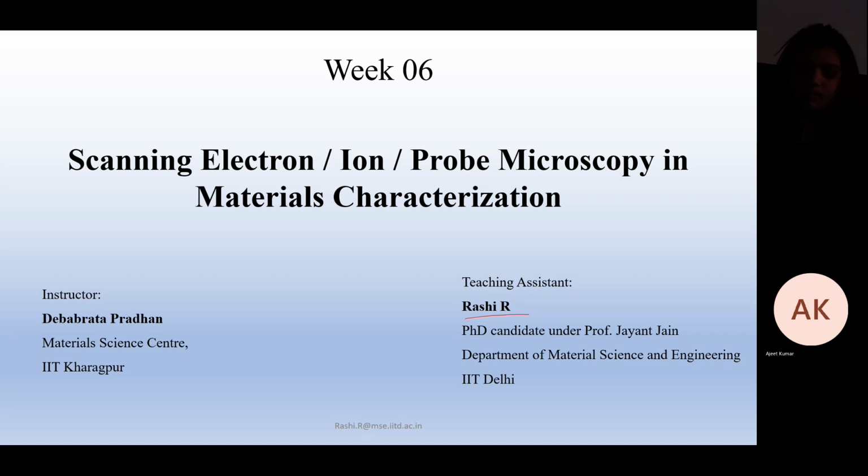Actually, I'm using just FESEM only. That is easily available. EPMA is a little bit difficult, correct? Yes, actually. But in IIT Delhi, you can book from outside also, and you can send the samples. They will do the sample analysis and then send you the results.